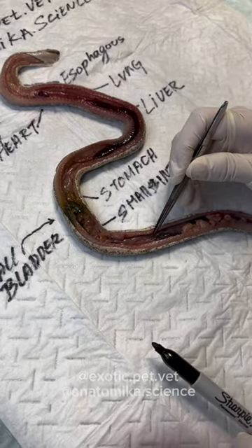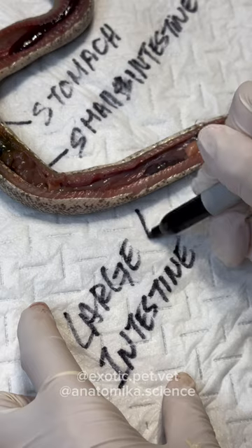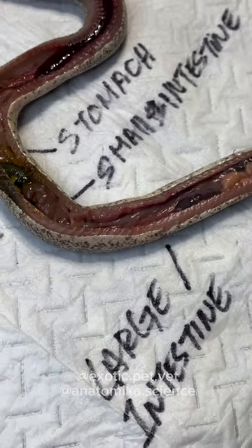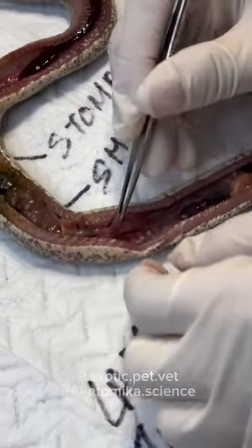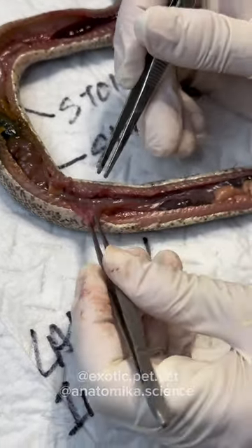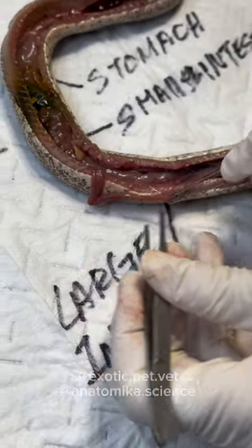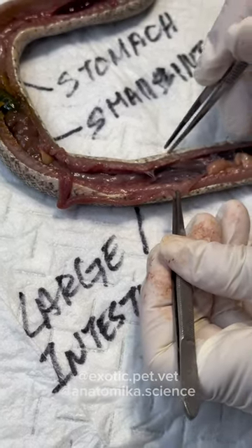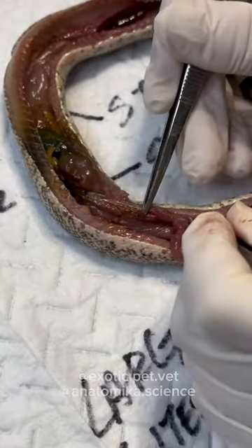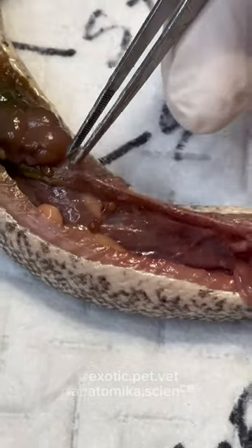After the small intestine you get into the large intestine — just the straight part. How did we know it was a female? Along the large intestine we see the oviduct and the ovaries. In many breeding snakes you'll see a lot of eggs or follicles. She was not sexually active at this point. They were really tiny and hard to see, but right up by the gallbladder — she has a couple of follicles, but she definitely wasn't breeding.